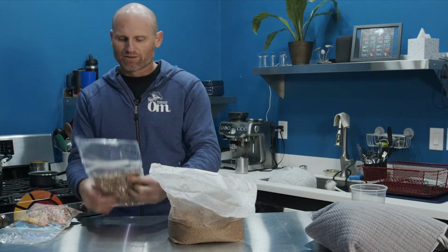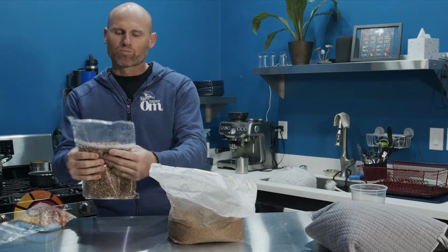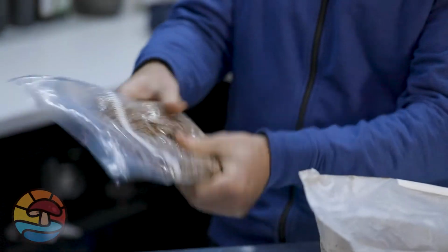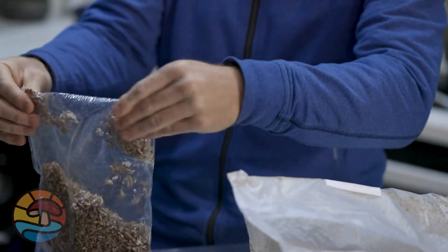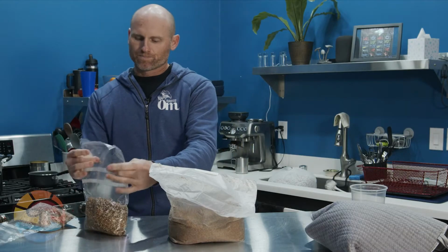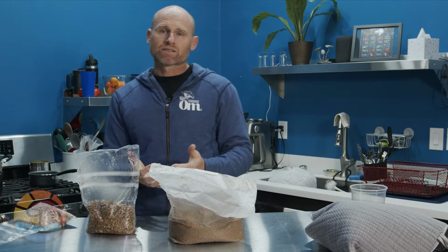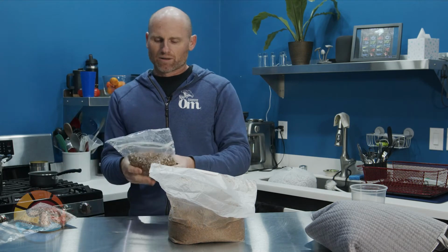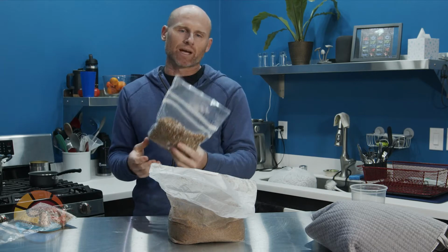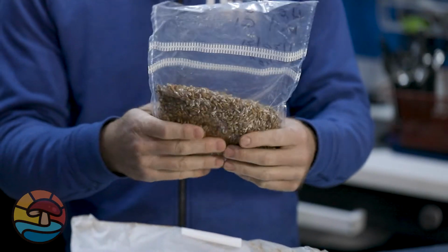For today, we have lion's mane. And this lion's mane is growing on oats. We're going to break it up to where all the kernels are in individual pieces. You want to break it all up. The rate of spawn that we're going to introduce needs to be a minimum of 3 to 5%, all the way up to about 20%. Today, we're going to use probably half of this bag for this 5-pound block. And this is about 2 pounds of grain spawn.